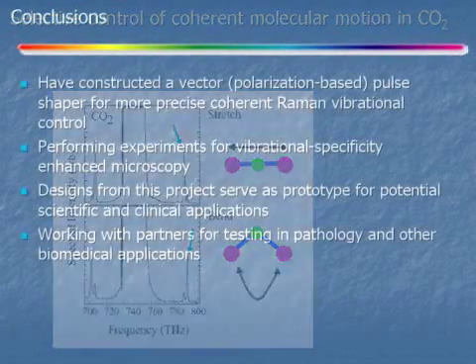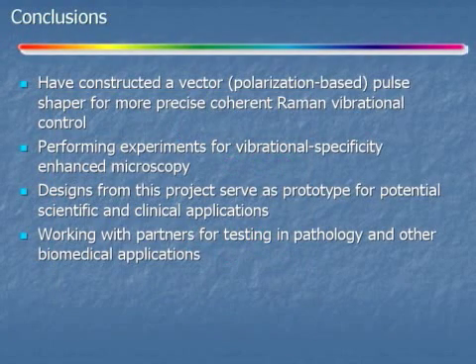So to conclude, we're basically exercising this new microscope technology, and essentially we're in a mode where we're looking for users, people that are interested in using this for basic science purposes, and looking for potential clinical applications in terms of pathology or various other places of interest. And we're working with some of the people in the vet school here to develop some of these possible applications. And then the idea is that the work we've developed here would serve as a prototype for potentially commercializing this work. That's all I have. Thanks.